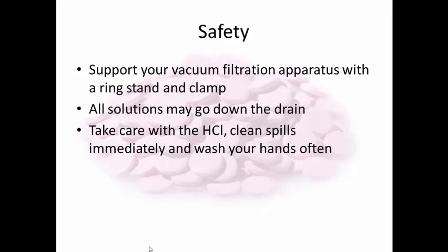Safety for this lab: you do want to support your vacuum filtration apparatus with the ring stand and the clamp so that we don't have this tipping over, but all solutions can go down the drain. We are working with some hydrochloric acid. It's a 2 molar hydrochloric acid, so be careful with this. Try not to get it on your clothes or your hands or your body at all. Make sure you clean up your spills and keep your hands washed. And this concludes your pre-lab video.